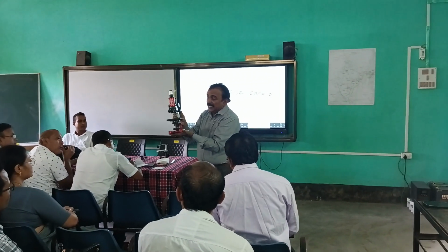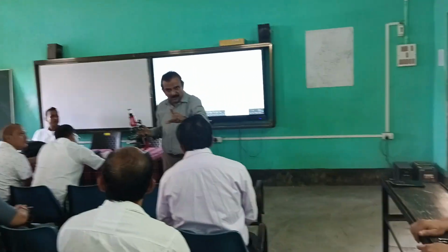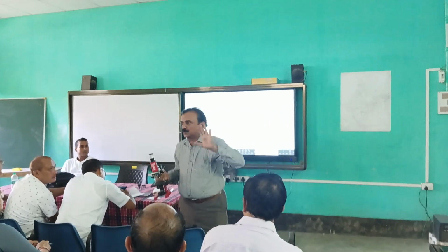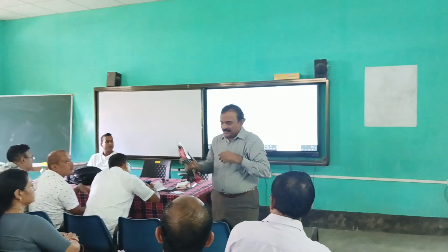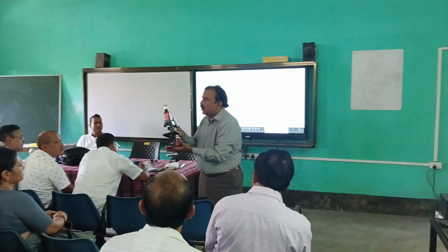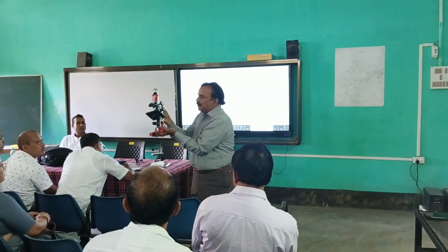So one important thing you need to remember. You are having a microscope, but many of you are complaining that my microscope is not working properly. It is made up of iron, so all microscopes can work. The only thing you need is education on how to properly use this compound microscope.